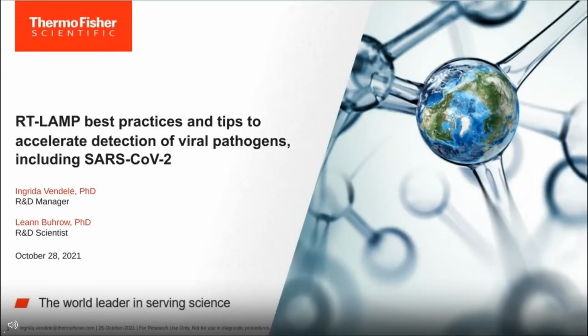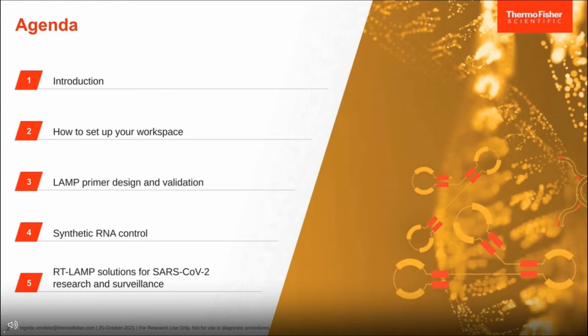Hello, everyone. My name is Ingrida, and I'd like to start by welcoming everyone again to this webinar focused on RT-LAMP. Today, we will start with a brief technical introduction to RT-LAMP as a method, and then share advice on how to set up your workspace when working with this highly sensitive technique. We will also cover LAMP primer design recommendations and share a simple practical example of primer validation process. We will also demonstrate how to generate a synthetic RNA control, which could be used to validate your reverse transcription LAMP results. And finally, we'll finish by sharing practical RT-LAMP solutions for SARS-CoV-2 research and surveillance.